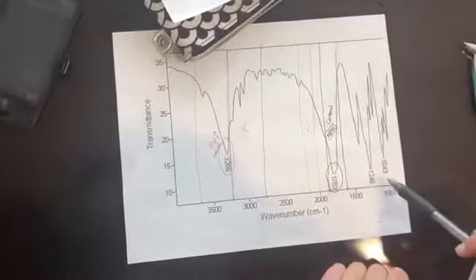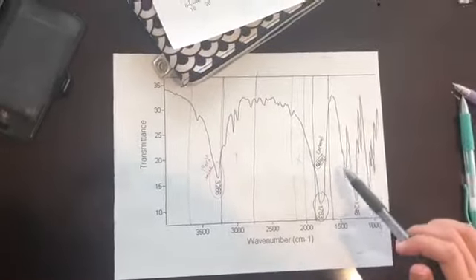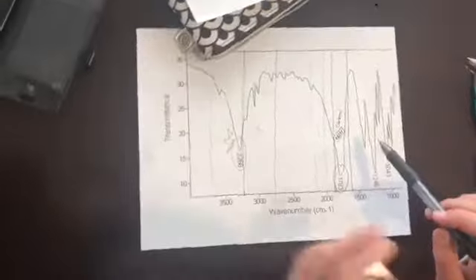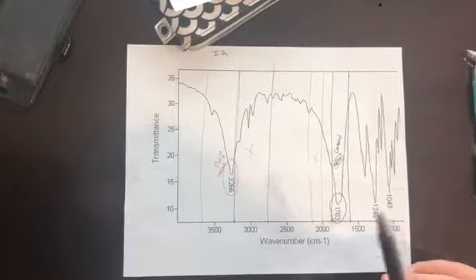And then this is the fingerprint region, and there's nothing really coding for anything in this area. And we don't see any peaks for an aromatic because my molecule, although it has some type of a ring, it's not technically an aromatic. And that is my IR graph.